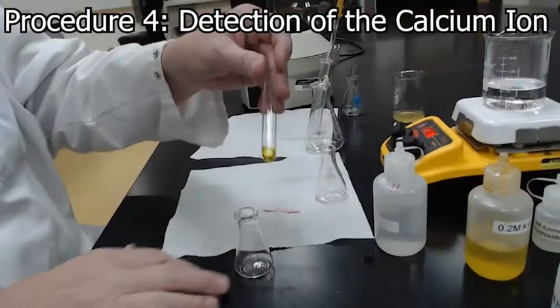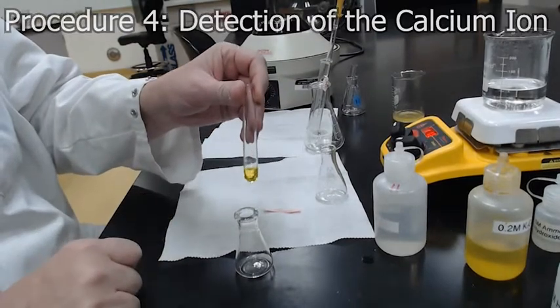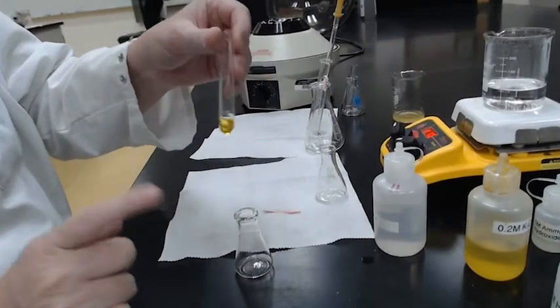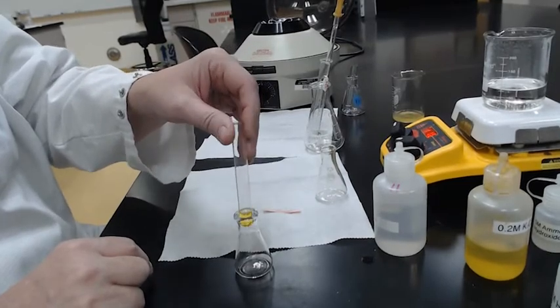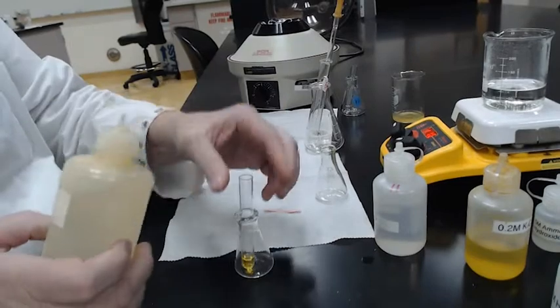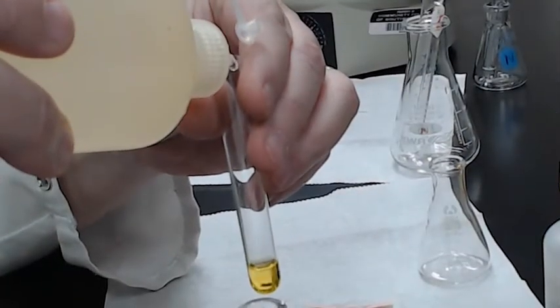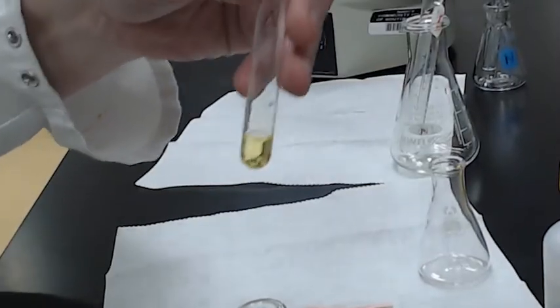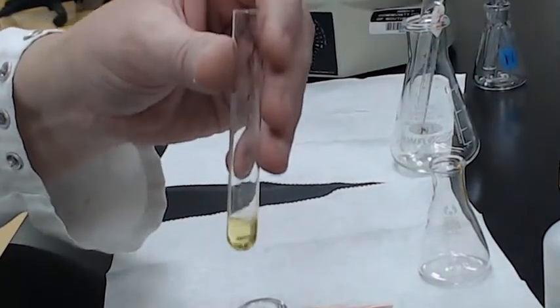We now have the supernatant that we collected from the barium step. It has some of the chromate color in it. We're going to see if we can show evidence of calcium. To do that, we're going to make it slightly basic. So we're adding a couple drops of ammonia, and the color gets brighter yellow, and that tells us that we're definitely in a basic form. So we know it's basic.